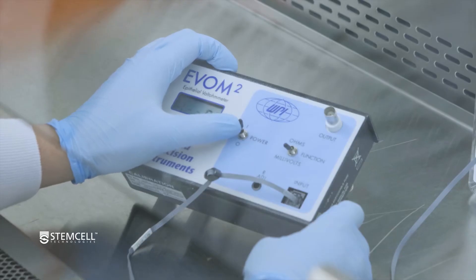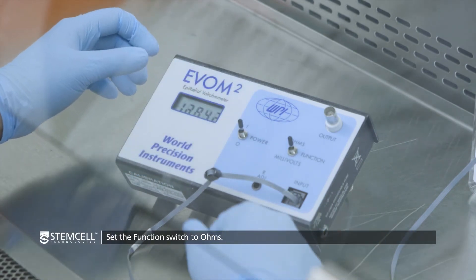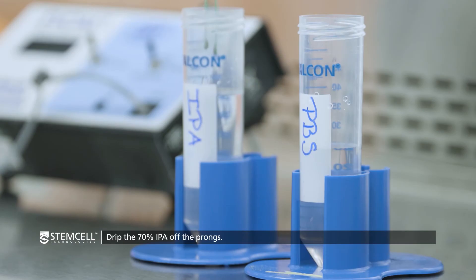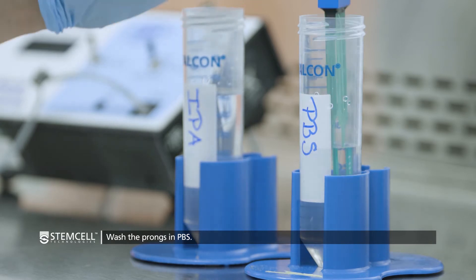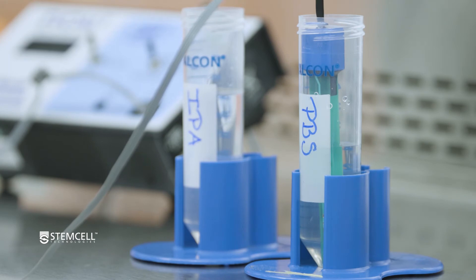After the probe is sterilized, turn on the EVOM and set the function to OHMS. Remove the probe from the IPA and allow most of the IPA to drip off the prongs. Wash the probe by submerging the prongs in sterile PBS, making sure the level of PBS is below the level of IPA sterility on the prongs.